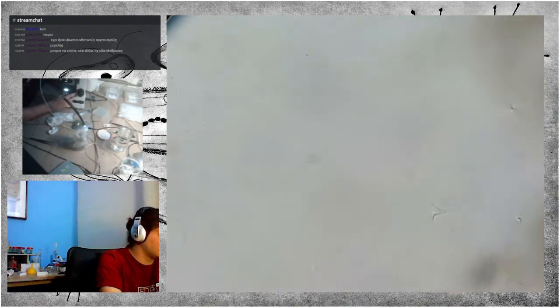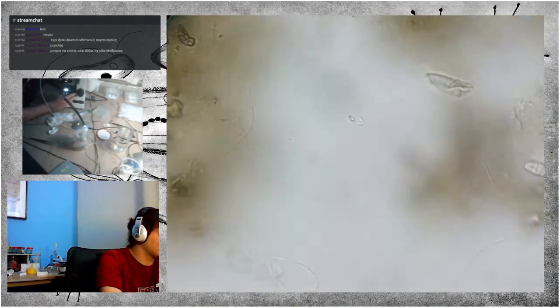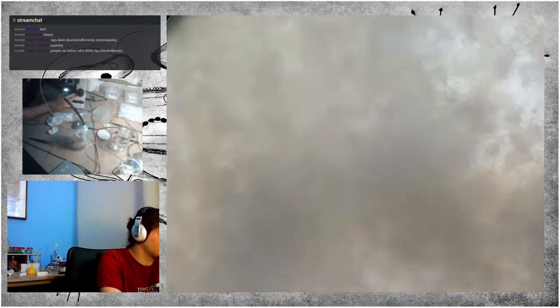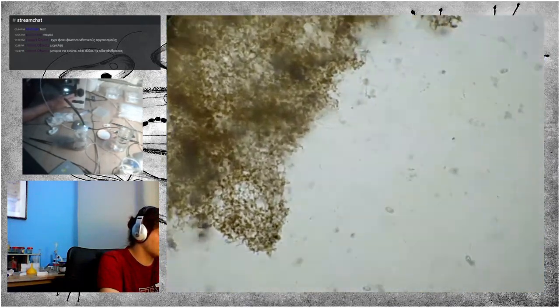Sorry. Now we are again at 100 times magnification.